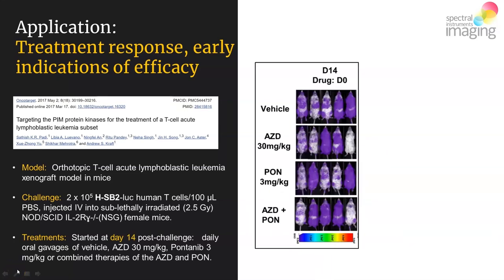So one of the nice aspects about this paper was that the investigators didn't stop with the initial efficacy results. They went one step further. What they did is evaluated the efficacy of the same drug treatment paradigms against an engraftment model in which drug therapy didn't start until 14 days after challenge instead of the initial 3 days. So what did they see?